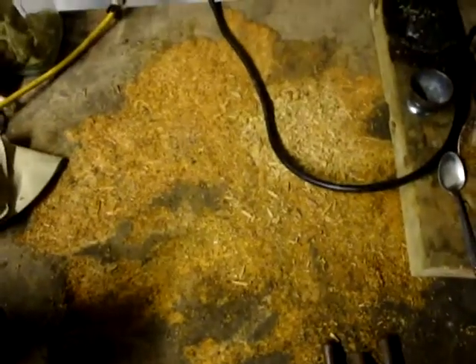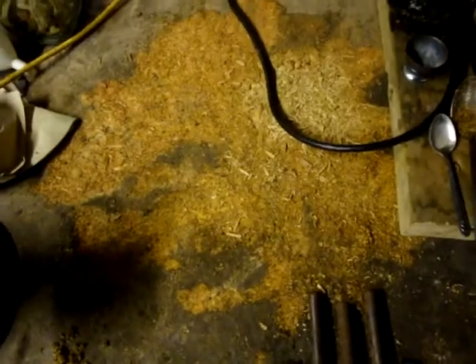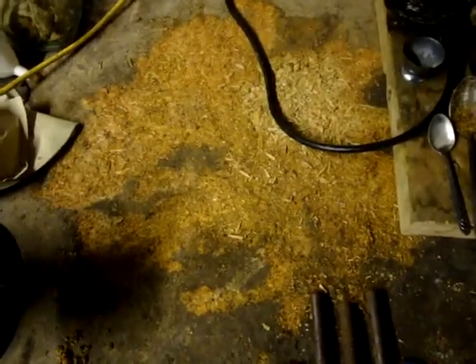Well, obviously what I was doing was I had a bit of glass on there, and it was all alright while it was hot. It was just because I added cold liquid to it to dilute the acid down, and it cracked. And I was like, oh. And then no liquid leaked out, so I thought, that's alright. And then, like I say, when I went to move it, obviously it went sploosh all over there.